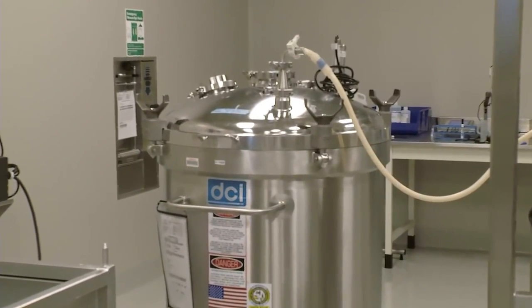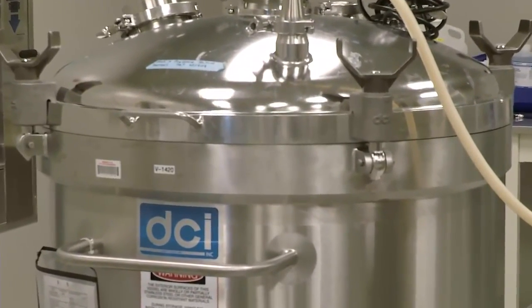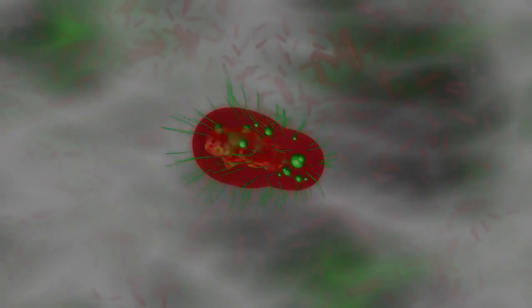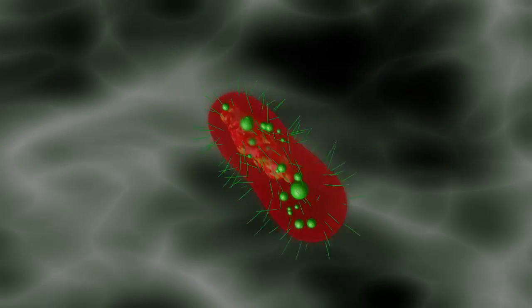The final product of fermentation is called broth. Broth contains the molecule of interest. However, the molecule is still locked inside a host cell. And millions of these host cells are suspended in a pool of depleted media and metabolic waste products. In the next step, recovery, we perform two important functions: separating the cells, solids, from the broth liquid, and separating the molecules of interest from their host cells.